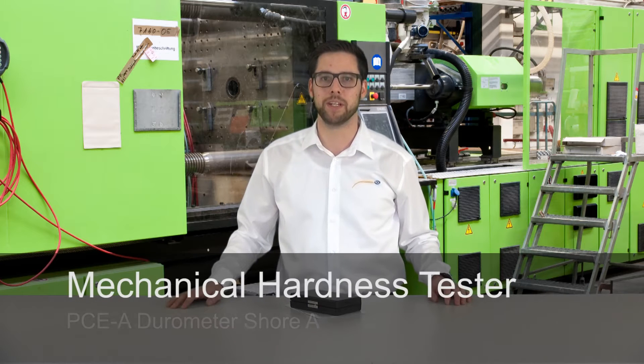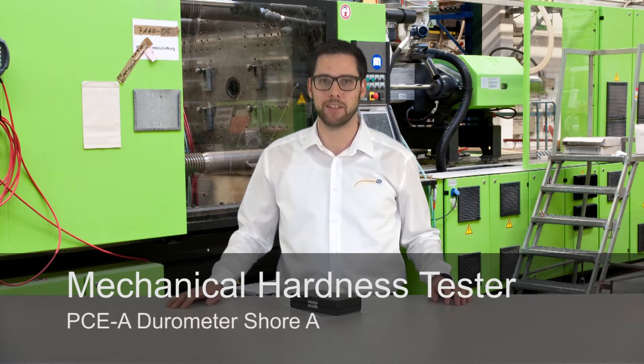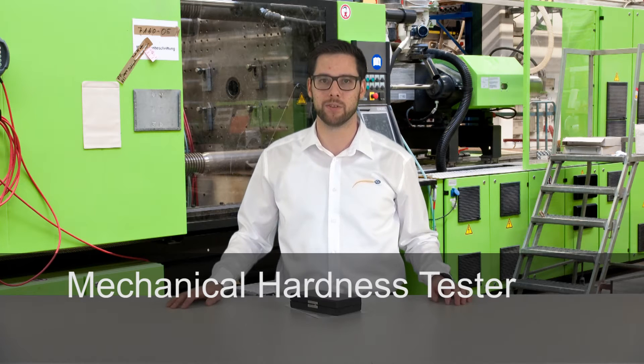Hello dear viewers, a very warm welcome to PCE Instruments. My name is Julian Geppert and I would like to present you today the durometer PCE-A. This is a mechanical durometer for the measurement of the hardness of soft rubber, rubber and elastomers in general.